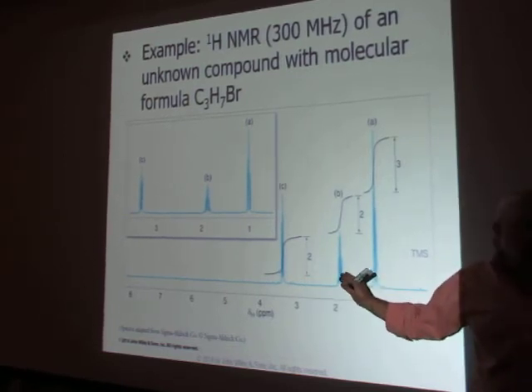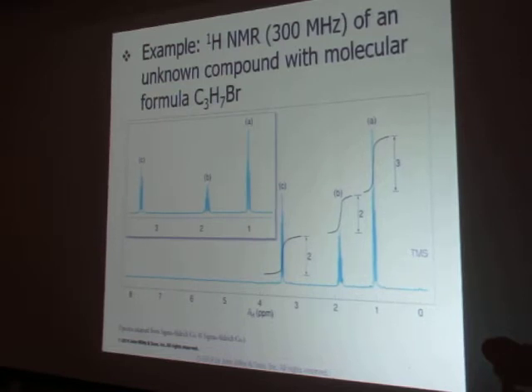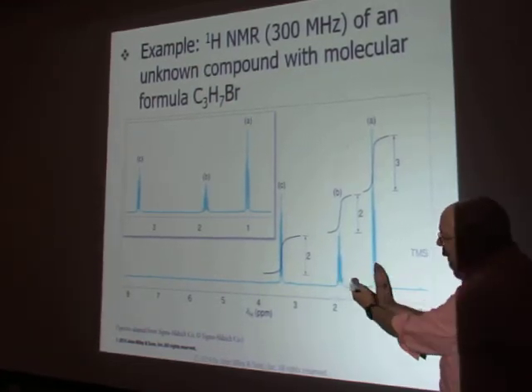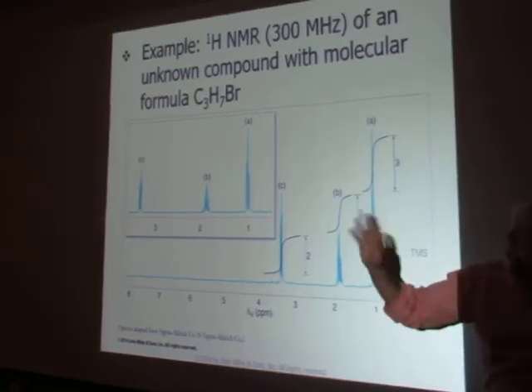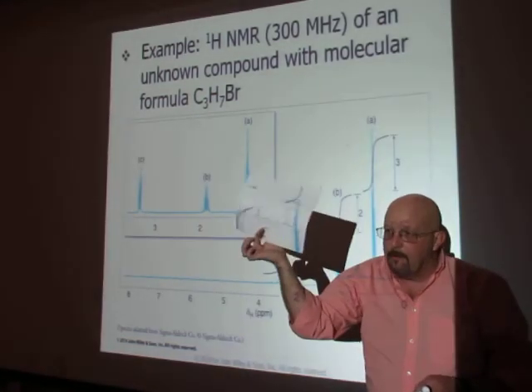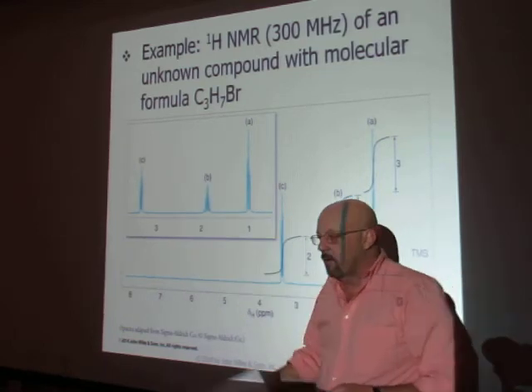These are just kind of close to the bromine, so these feel the effects of that just a little bit. So they get shifted just a little bit outside of their normal range. That should have been an alkane proton, should have been right there, but they get shifted just a little bit because they're kind of close to the bromine. So like I said, don't get locked into my chart. This is very helpful, but realize this is just a starting point.